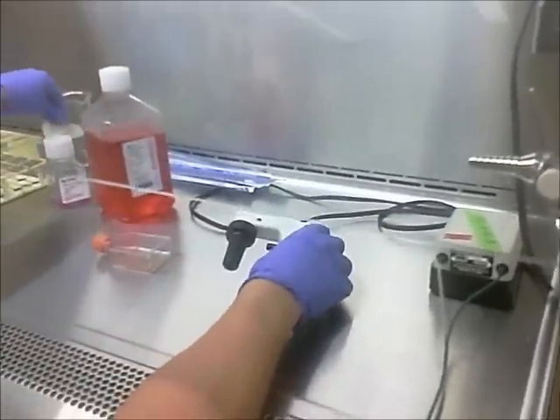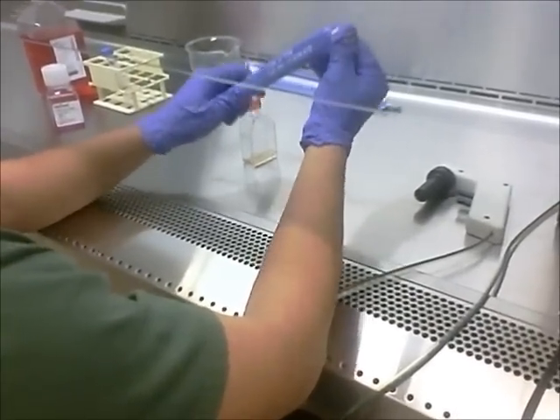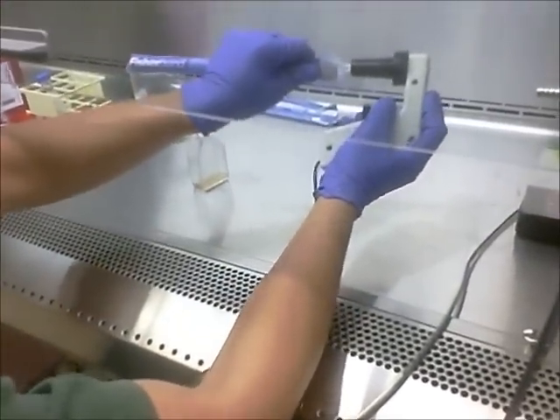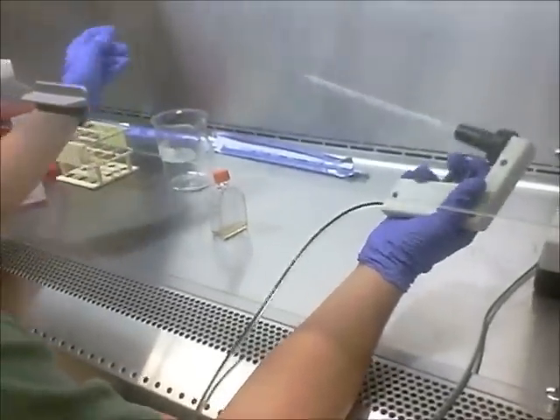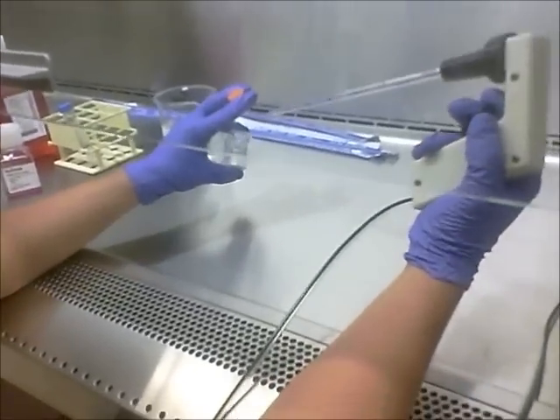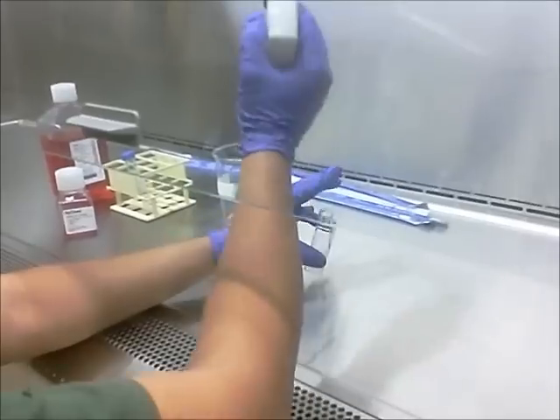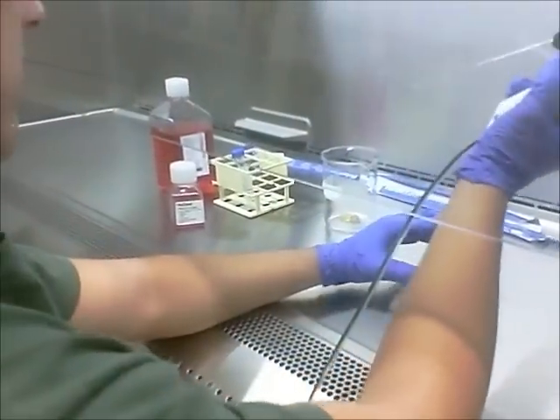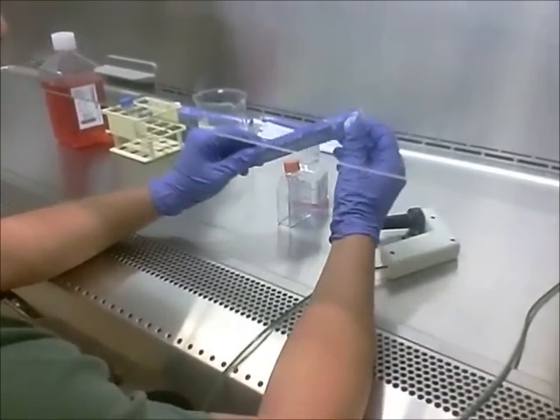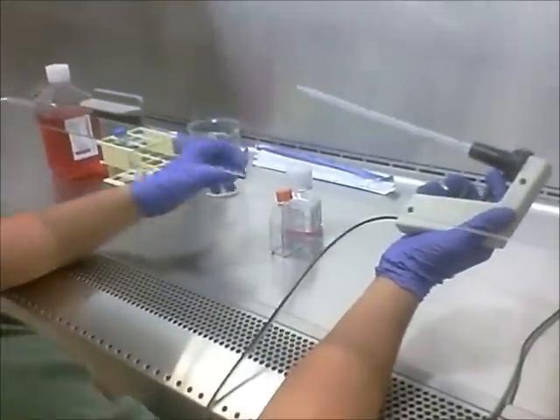We're going to begin by getting a pipette and undoing the top, hooking it to the pipette aid, and removing it from the packaging — making sure not to touch the tip to anything. We're going to take the lid between our fingers, not set it down, and not contaminate it. We'll carefully remove the old media and place it into the waste jar. Then we're going to start with the trypsin, using a new pipette, again making sure not to touch the tip to anything.